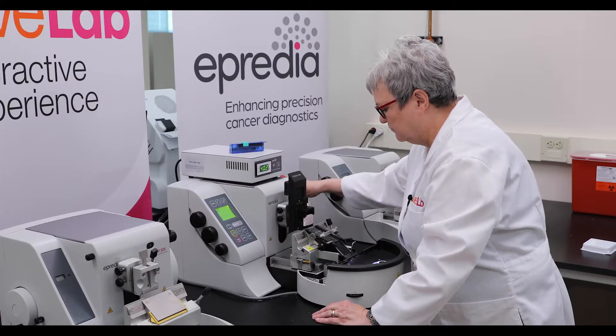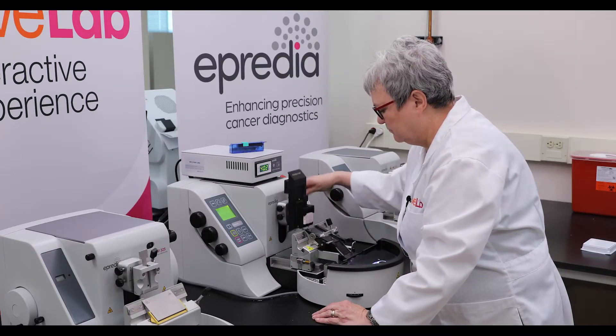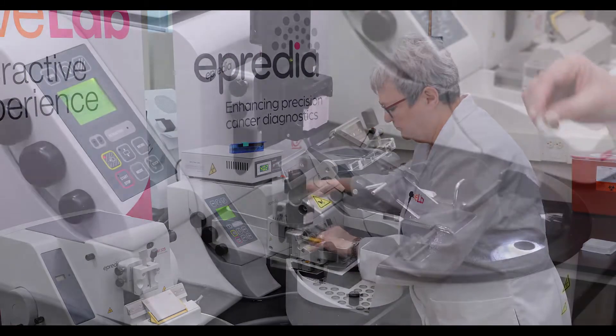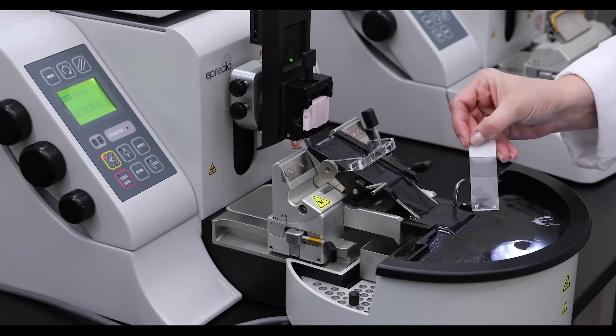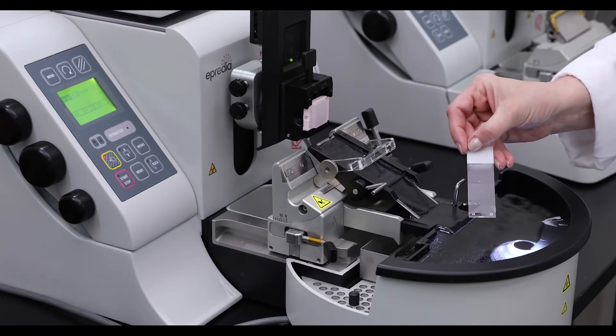When using the section transfer system, the common manual transfer of the sections into a water bath is no longer necessary, not only improving section quality but also providing you with better ergonomics.